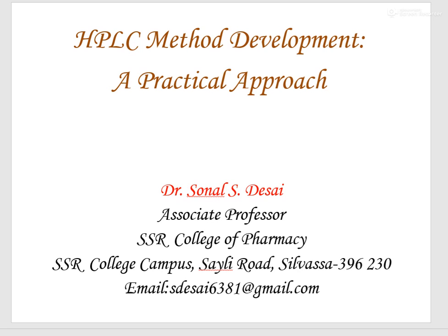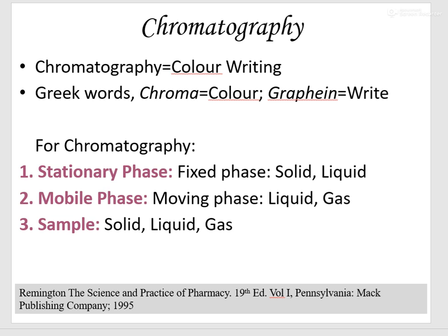Today we will discuss HPLC method development, a practical approach. Before learning about HPLC and its practical approach, let us know what is chromatography. Chromatography is known as color writing. The word chromatography is obtained from Greek words chroma, meaning color, and graphein, meaning to write.